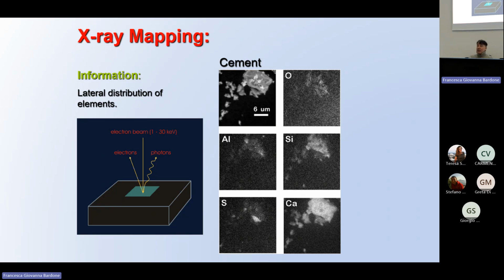If you have calcium in silicates, you should have standards with calcium in silicates. And we have a lot of different standards as a function of the type of material. Not only the element, but the element with a specific environment, specific matrix, because most of the interaction is also with the other atoms.